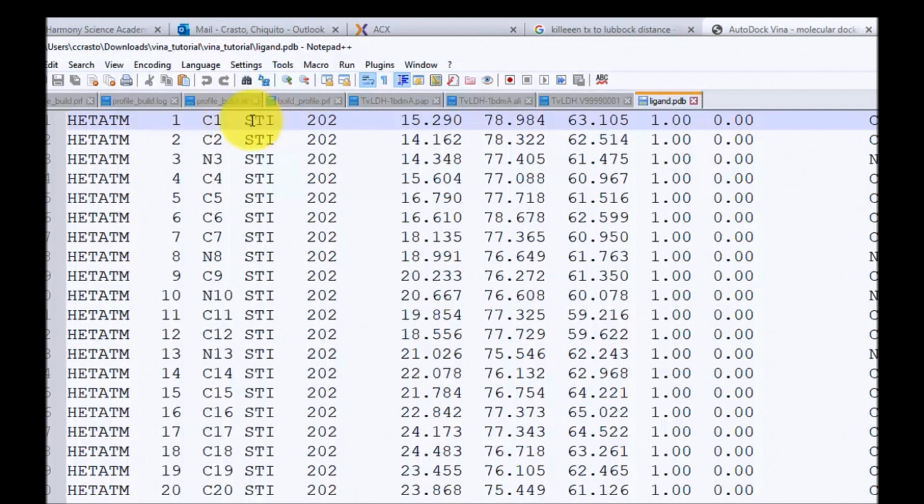That's the name. That is typically where you would find the name of the amino acid residue. Here's the position number, X, Y, Z. This is the atom type. This is the thermal factors. In this case, we're not really concerned about thermal factors, so that is set as 0. And then this is the multiplicity.